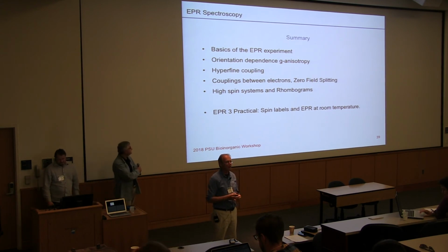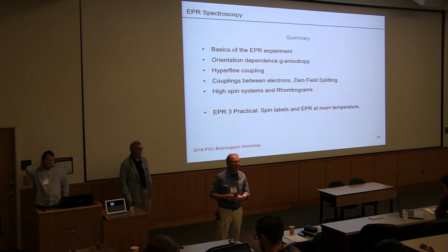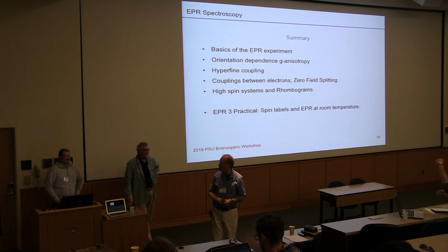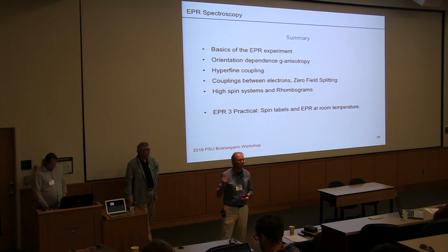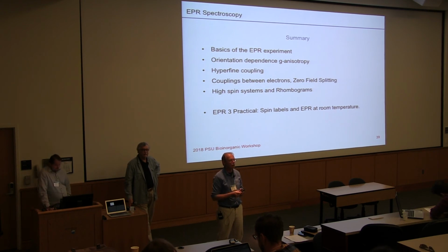And that's actually a perfect segue to our next lecture, which is pulsed EPR, where Alexei is going to show us EPR techniques which allow us to take a system where you have that situation where the lines are not resolved because you have so many couplings overlapped, and be able to actually pull them out of the data.